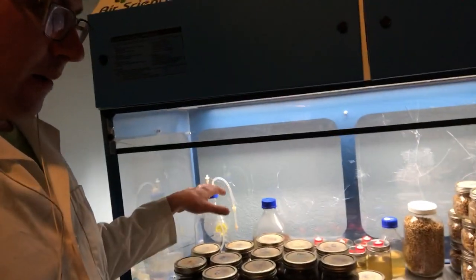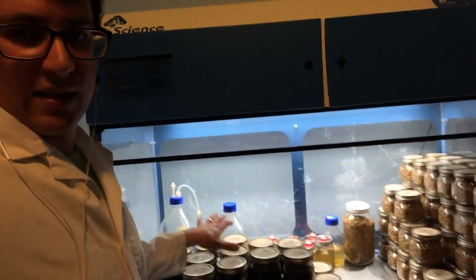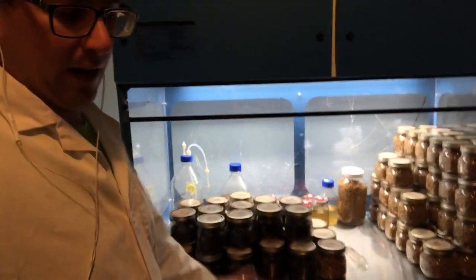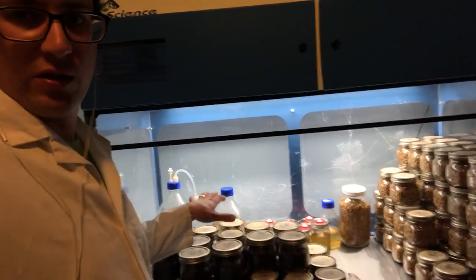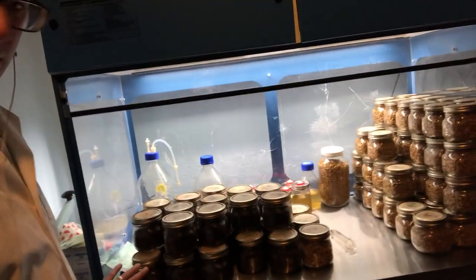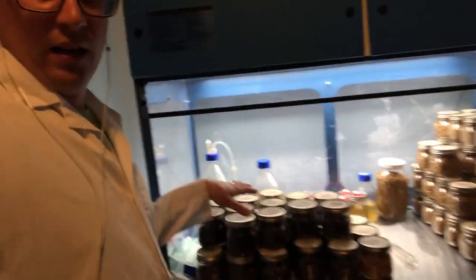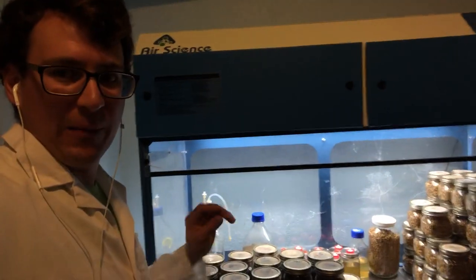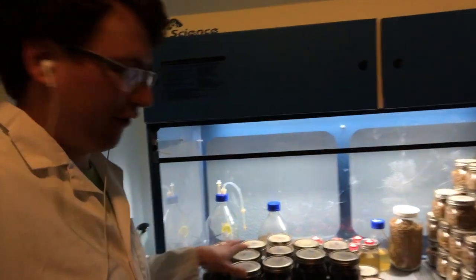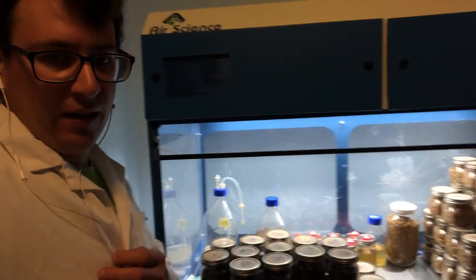So I hope you guys enjoyed this video. I can't stress enough how important it is to QC your liquid cultures, especially before you go and inoculate a bunch of these jars. But these are all going to be going outside around my yard. I'm pretty excited. Hopefully I can get some mycelial networks of morels.